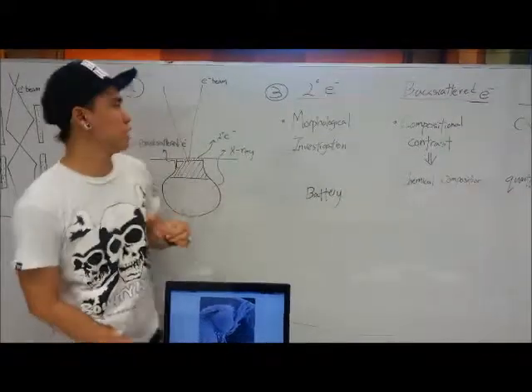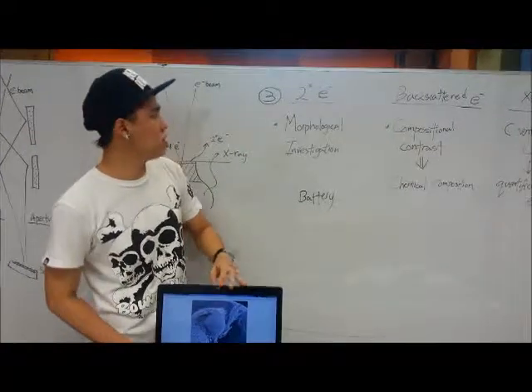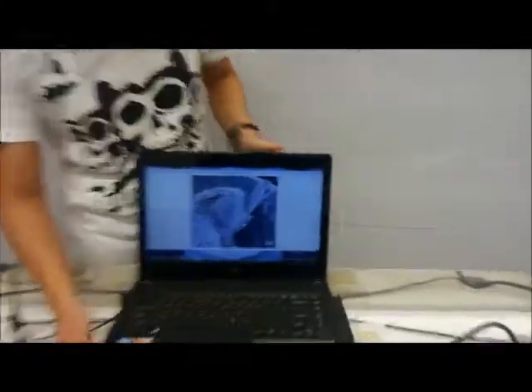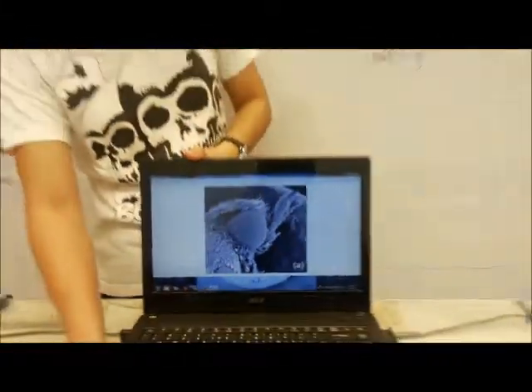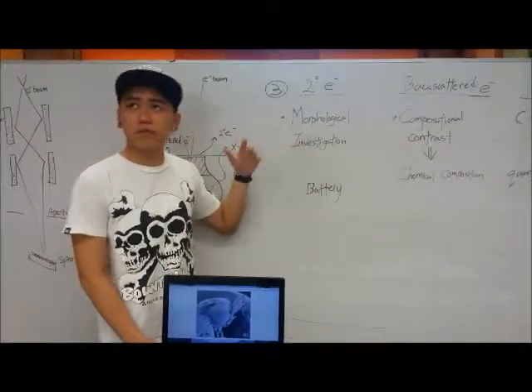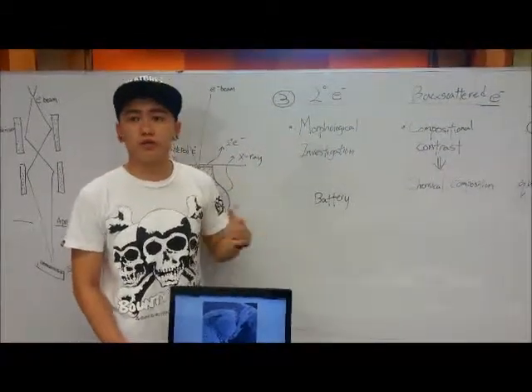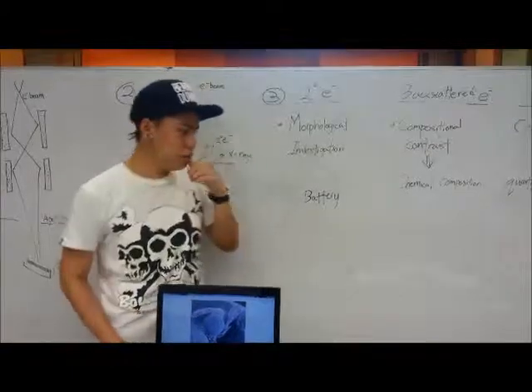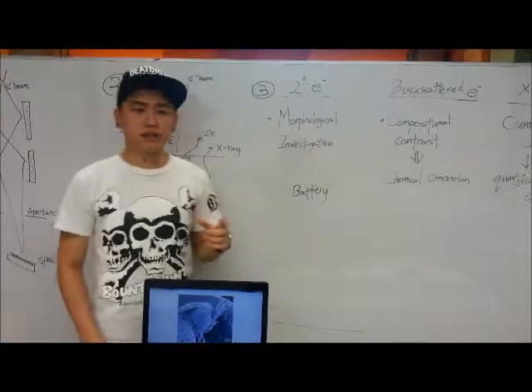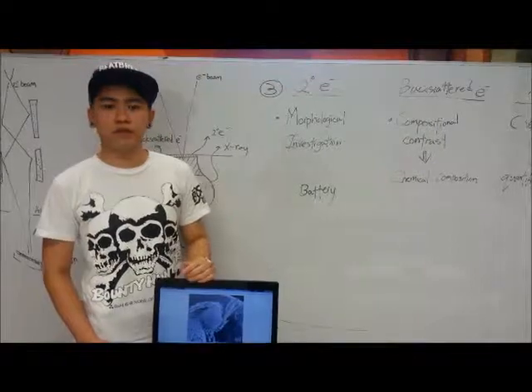Earlier, we obtained three results from SEM. From the three results, we can find out more about the applications. So for a start, we'll talk about secondary electrons. This will be the image which we obtain from it. From this image, we can carry out morphological investigation. It's something like a quality check, which companies manufacturing nanomaterials will use. For example, a company which manufactures batteries will use nanotech to enhance their material properties by reducing the size of its active materials.